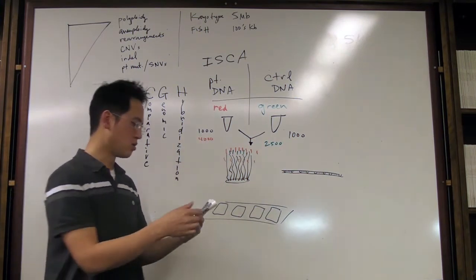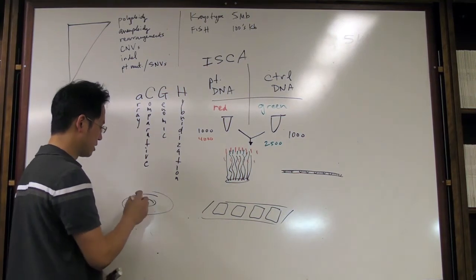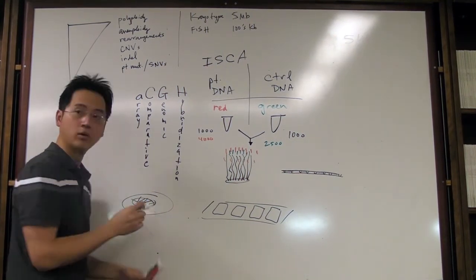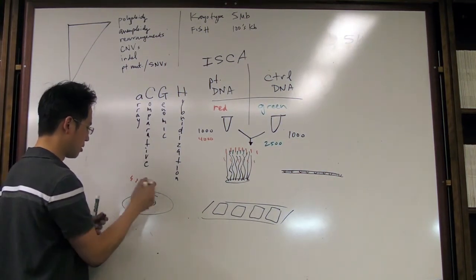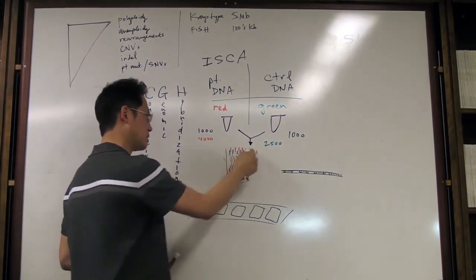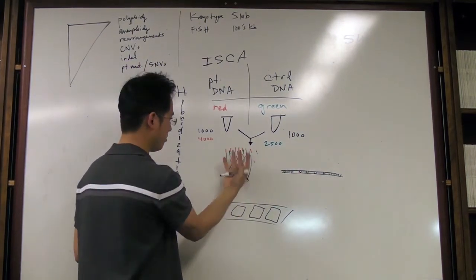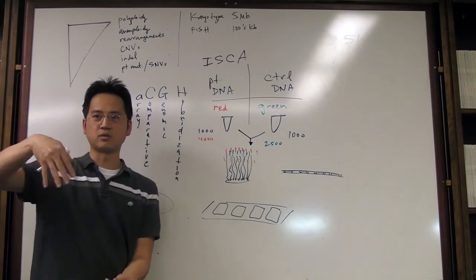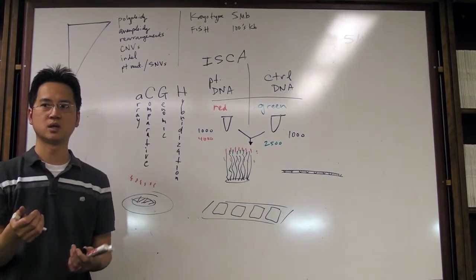So whereas in the in situ assay, we have the patient DNA immobilized here, waiting to be probed by some colored probe. So let's say there's a red probe getting showered down here. In array CGH, it's the opposite. It's the patient DNA that becomes sort of the probe by being labeled, but what is being immobilized is on the probe itself that's sitting on the chip. So you can basically flip it in reverse, and that's what array CGH is.